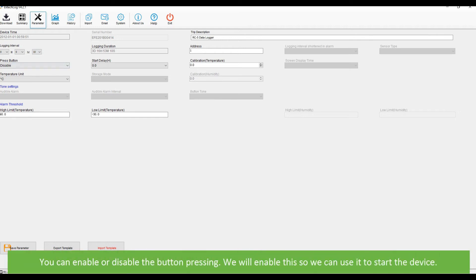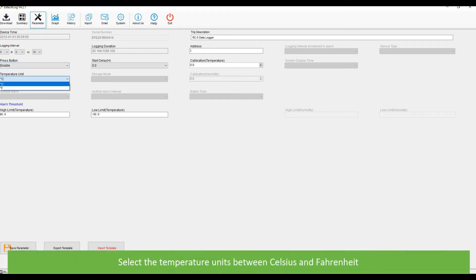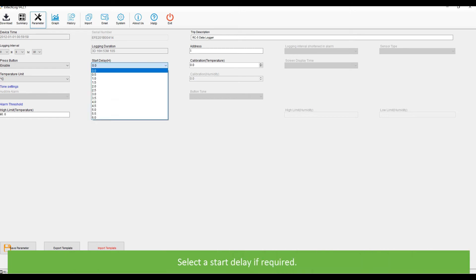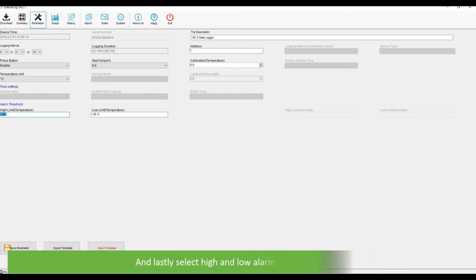You can enable or disable button pressing. We will enable this so we can use it to start the device. Select the temperature units between Celsius and Fahrenheit. Select a start delay if required. And lastly select high and low alarm threshold limits.